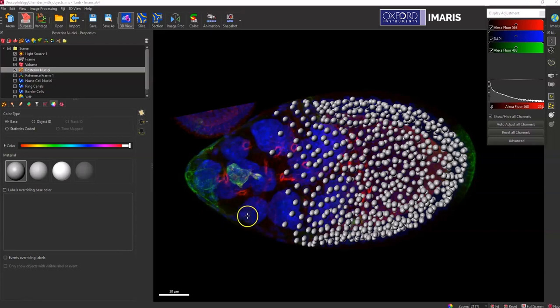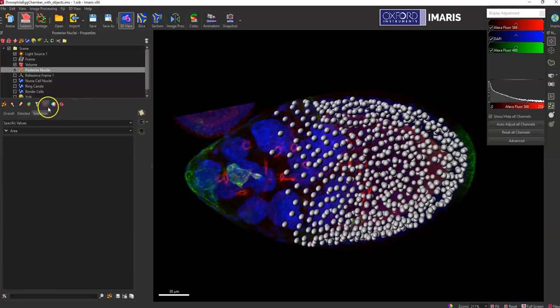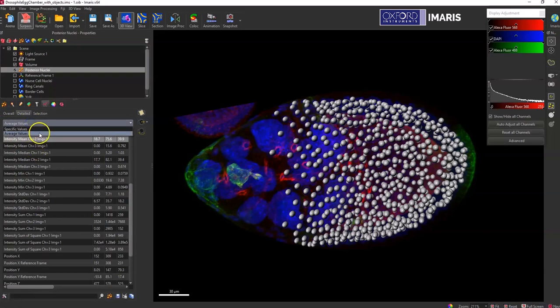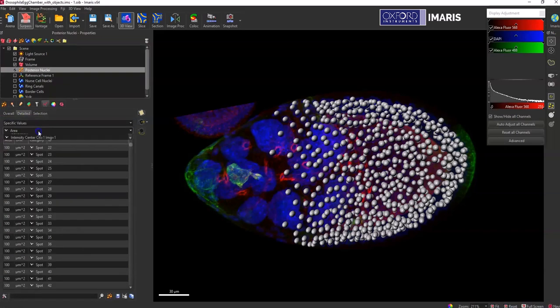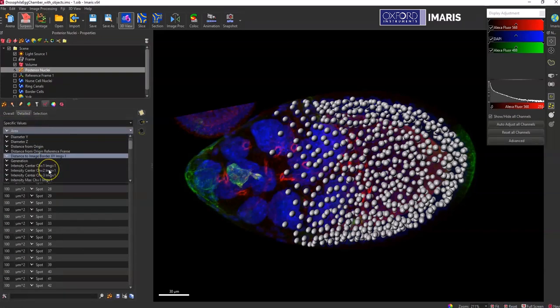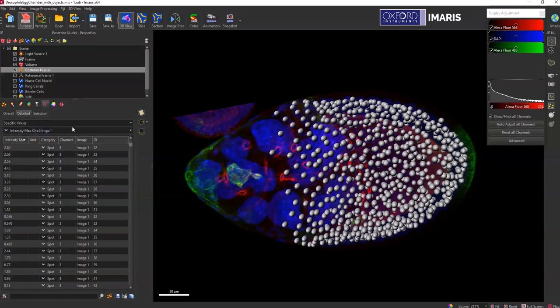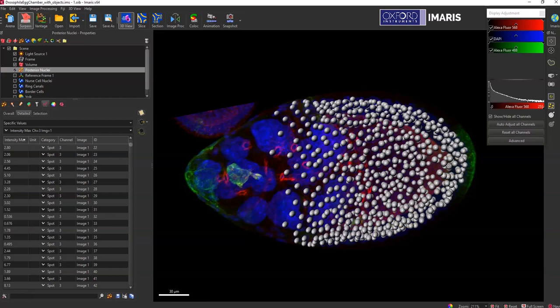The easiest way to do it is, if I'm in the statistics tab and I want to know the intensity value of a specific channel, like the mean intensity or the max intensity of channel three, but I only want to know it for certain spots.